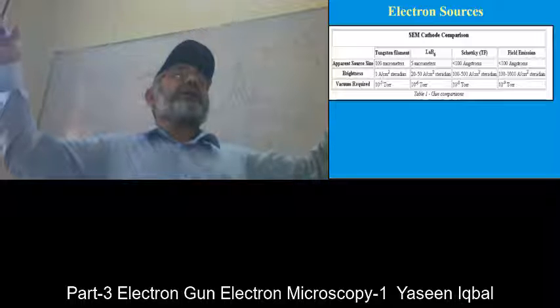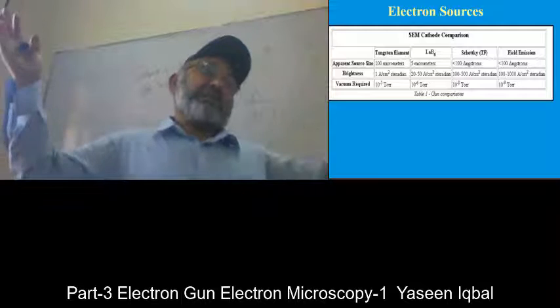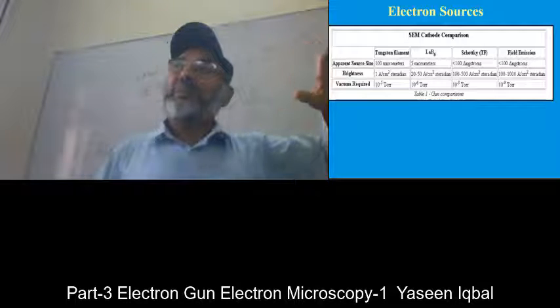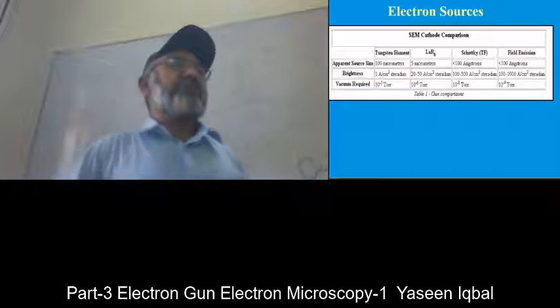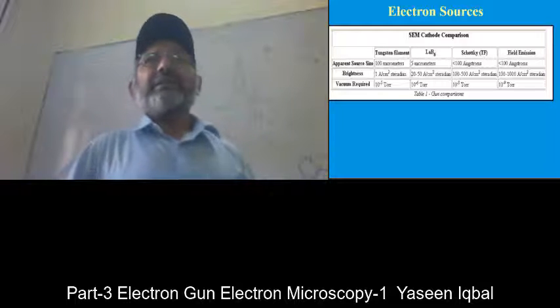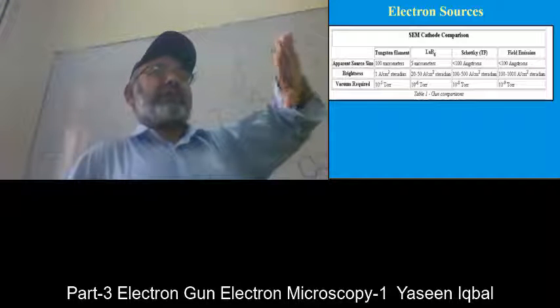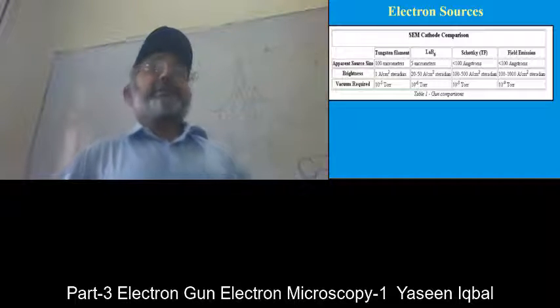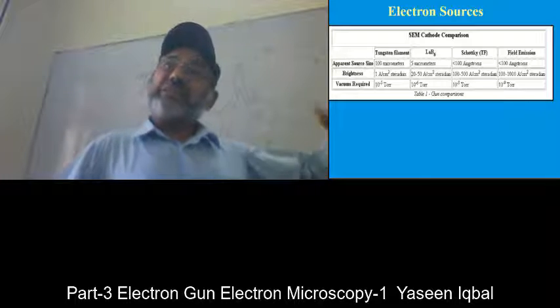But the quality is not possible for large spaces. So when the space is limited, then the tilting of the sample will be restricted. So in the old days, I used a microscope. It was 200 CX JEOL, which has now been discarded, but I could tilt the sample 45 degrees like this, 45 degrees like this, and it almost gave you 90 degrees in each direction. The modern microscope, you can't go beyond 30 degrees because the space is limited.